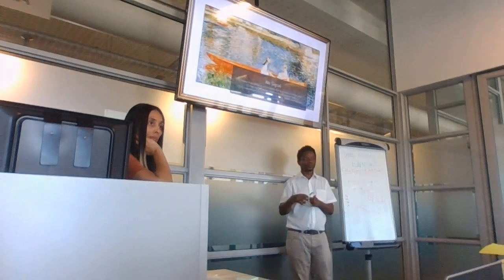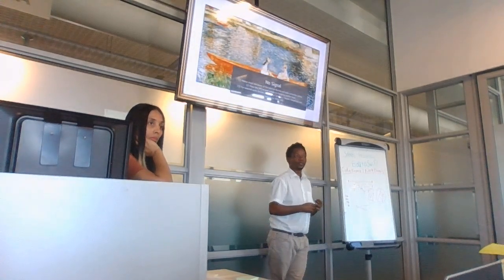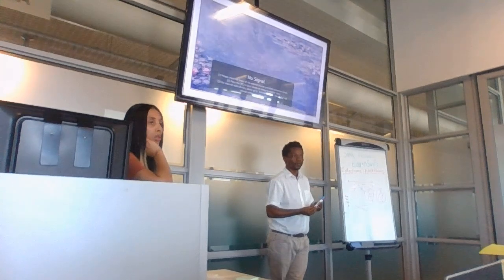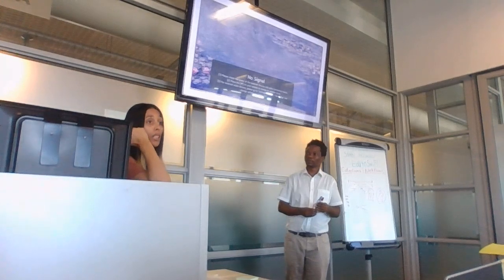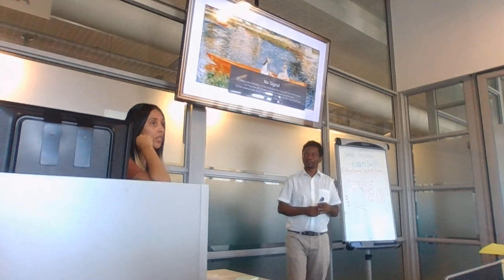This is what I was telling her. I think the main idea here is to save time. So we only do it on the one, because it already took hours on that one forward read. And this was a 5.8, a 60% subsample, 60% smaller than the original file.